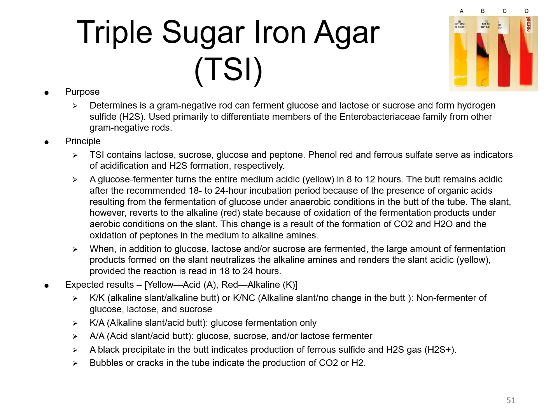If glucose is the only sugar that's fermented, then there will be a small amount of acid production on the slant that will be oxidized to a more neutral product. So it'll go from an acid appearance, which would be yellow, and then it would go back to a red appearance, just where it would be in the presence of the oxygen, and it would remain at an alkaline state.